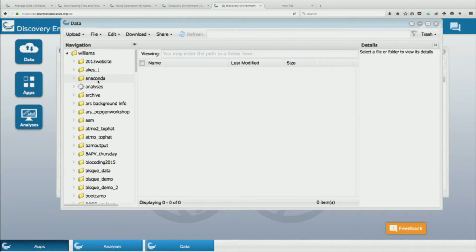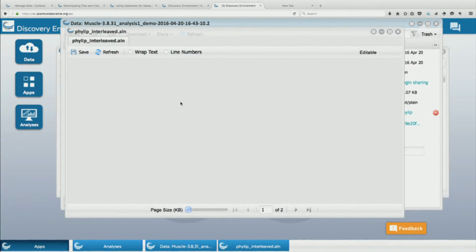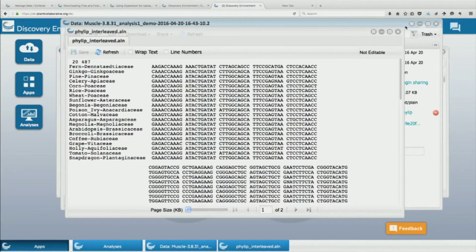And again, this becomes important. Things sometimes get very similar names, but here I don't have to worry. So I can click on it. The output of my job is here with these files that are now in alignment. These are these sequences. Okay.